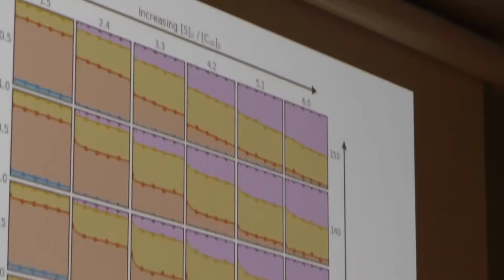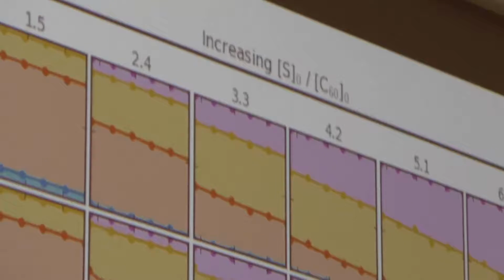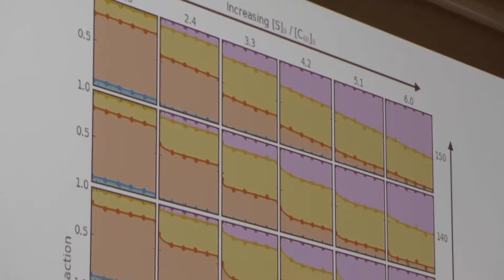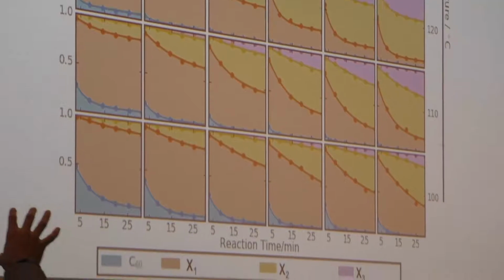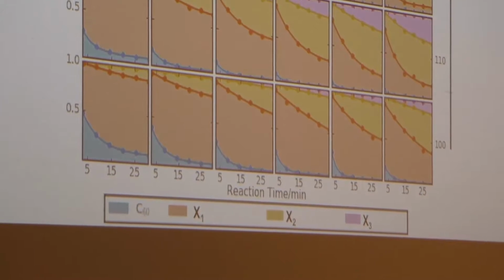And each of the data points here is a different measurement. And hopefully, you don't have to look at this too carefully, but hopefully if you look from top to bottom or from left to right, you can see that this system is behaving in a nice, smooth fashion. So you can see that without even studying what's happening on a detailed level, the reactor is giving us good control over the product.